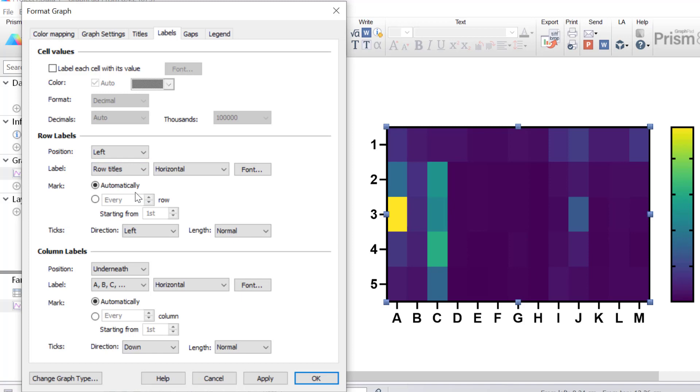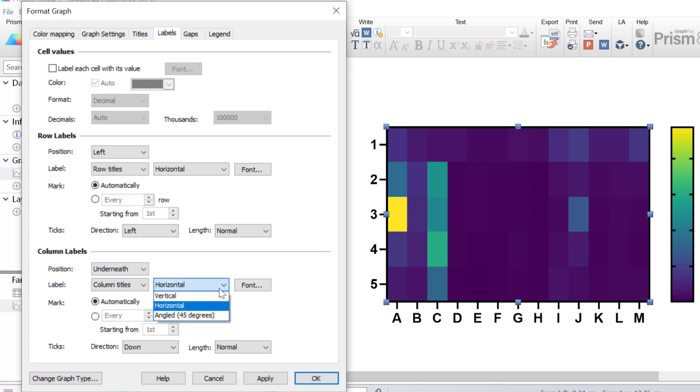I'll then go to the labels tab and then what I want to do under row labels, I want to change the label to be row titles. So in this case, the row titles are the different time points. And similarly for the column labels, I want to change this to be column titles.